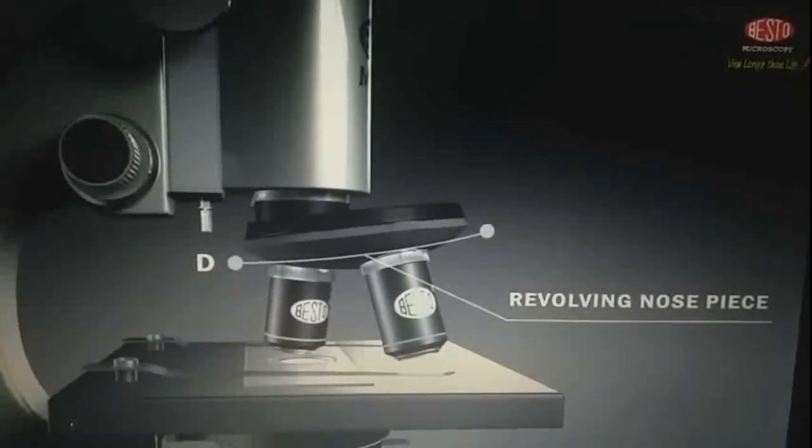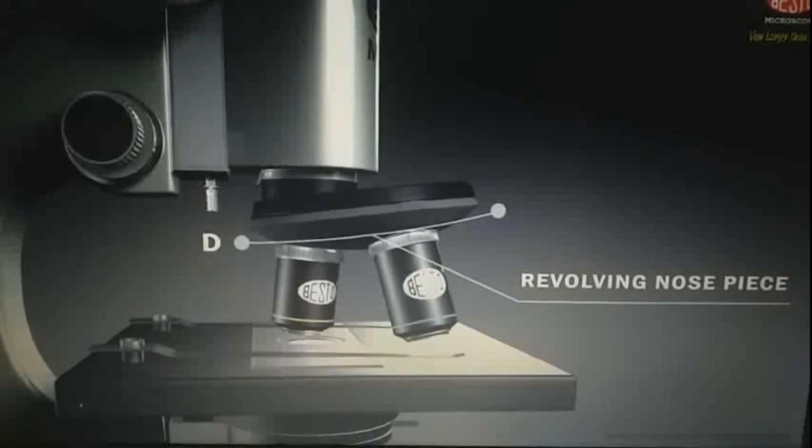D, revolving nose piece. It holds the objective and allows you to change objective while looking at slide or sample.